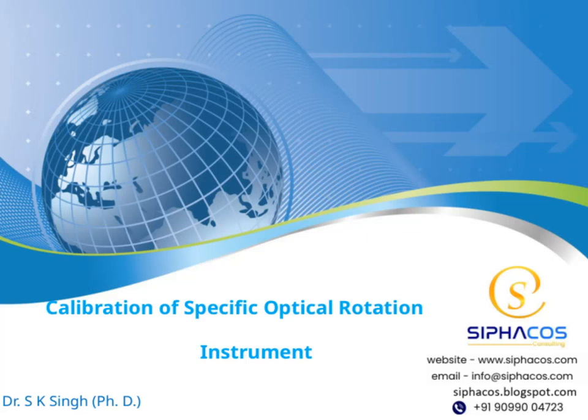I'm Dr. S.K. Singh, and today I will be guiding you through the calibration of a specific optical rotation instrument. This is an essential process to ensure accurate measurements in optical activity studies. Over the course of this presentation, we'll cover the fundamental concepts, the calibration procedure, and some practical tips to maintain precision. I'm excited to share this knowledge with you, so let's get started.